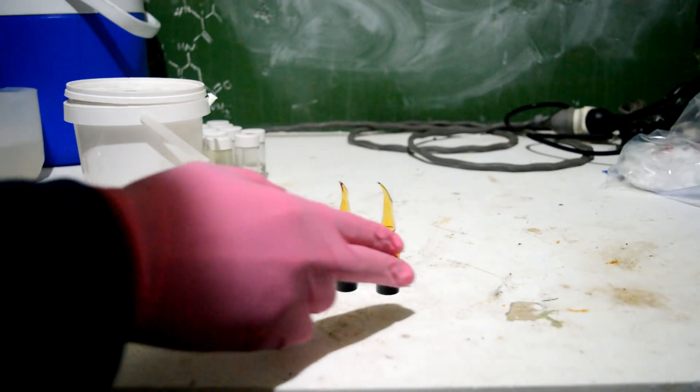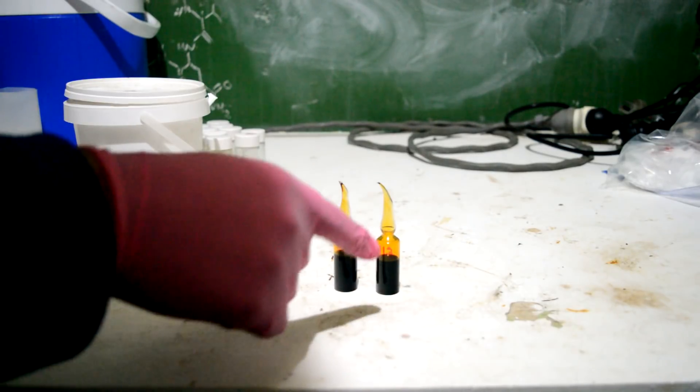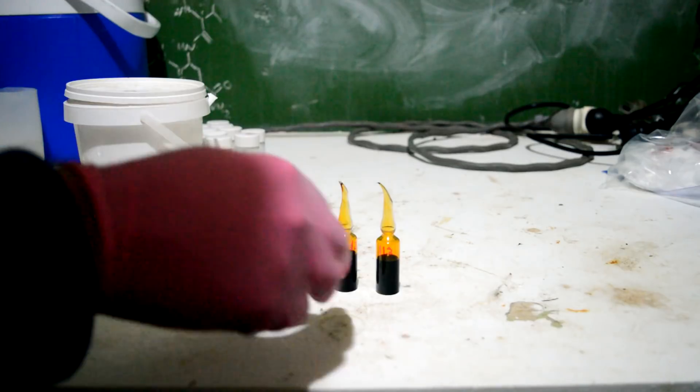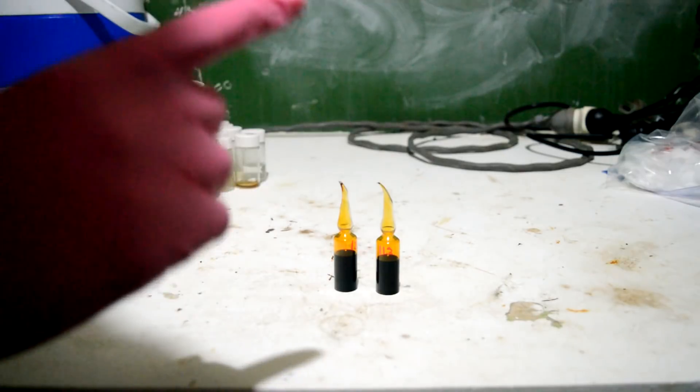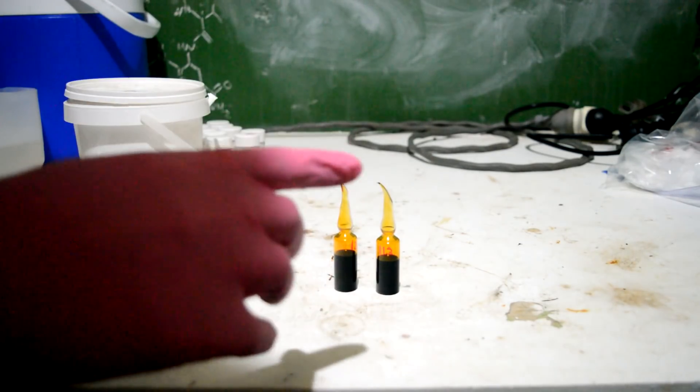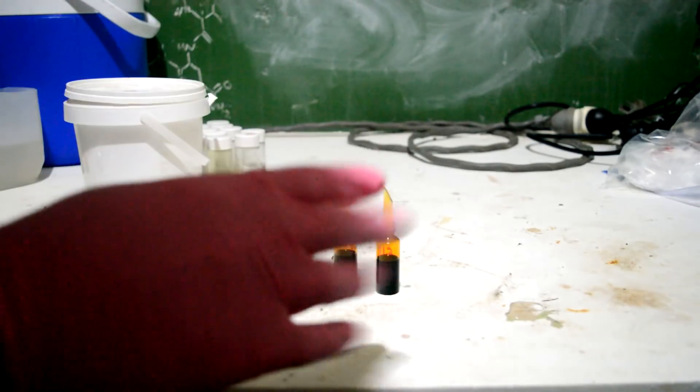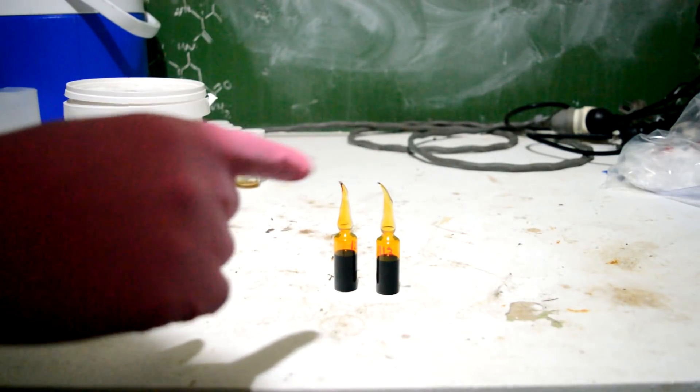Just wanted to finish by showing off a really cool optical property of bromine. Bromine is obviously very opaque in the visible light spectrum, but in the infrared it's quite transparent. I've totally stolen this idea from a channel called Random Experiments International — always great videos, so go check out his channel.